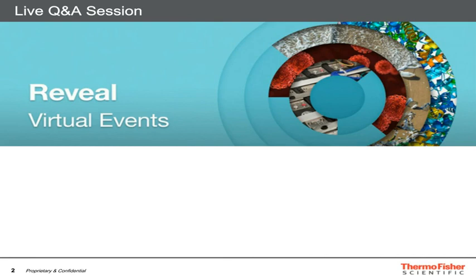They're all technically possible. We could try. It will not be easy to image these bonds. What we can do is to use iDPC and the very high sensitivity STEM Panther STEM detector, and we could image. You can see the atoms, and in this method, we will not be able to directly tell you what sort of phase they are, particularly, but you will be able to see them. It can be challenging, but it's achievable.